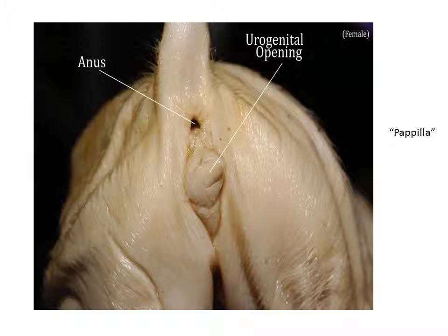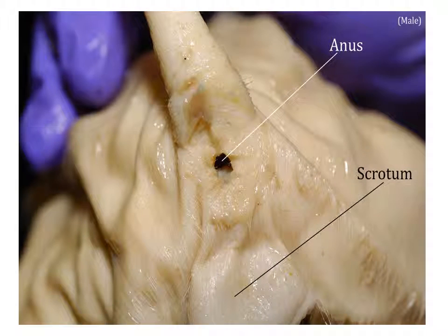Here they are again. I don't think that this is a typical image for one of the girls, but just remember that where you might think of the female genitals as a whole, really they protrude for the pig. Don't confuse it with the end of the gut. And again, the guys will just have kind of a flap that you'll be able to identify down there.